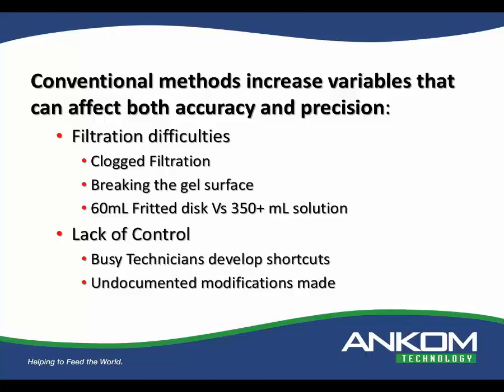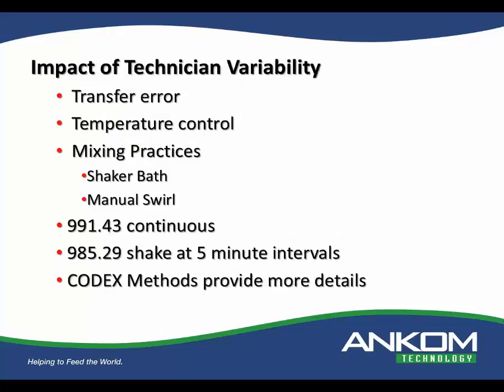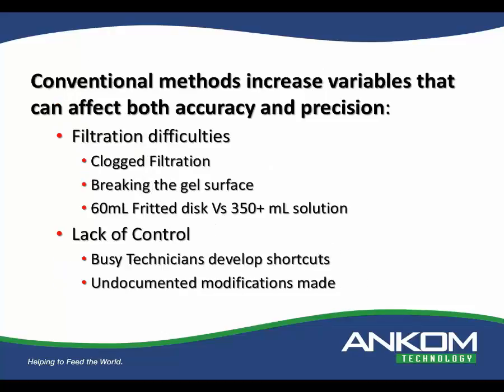So these undocumented modifications are made because, well, this is what someone told me to do. That can be a problem. So those are the kind of things we talk about when we talk about the impact. Those transfer errors, the temperature control, the mixing practices, how the mixing is supposed to be done, the issues around filtration, and just the lack of control that can happen when you have a technician.